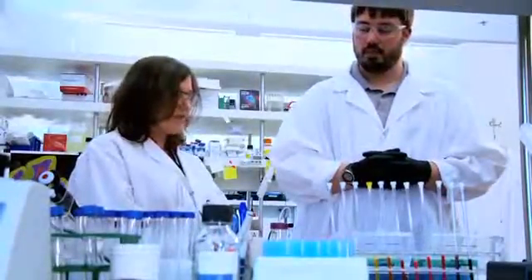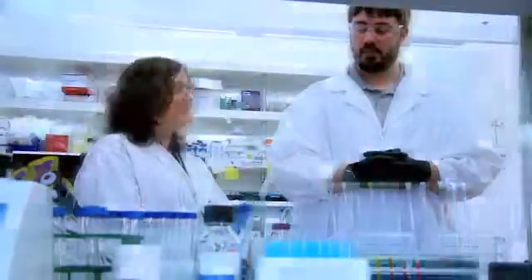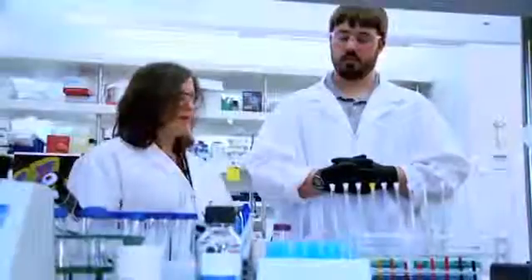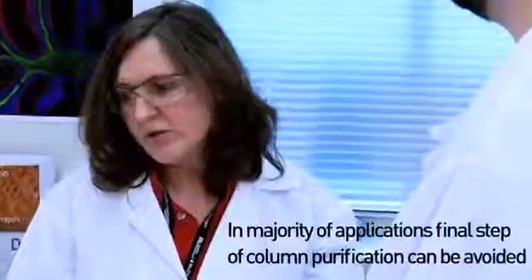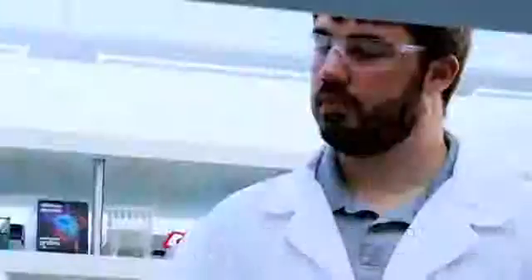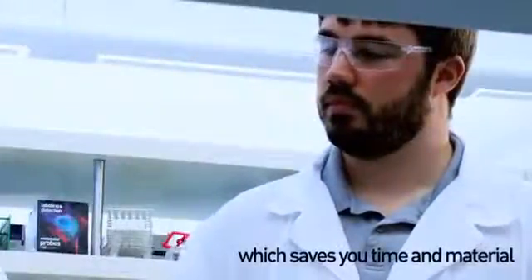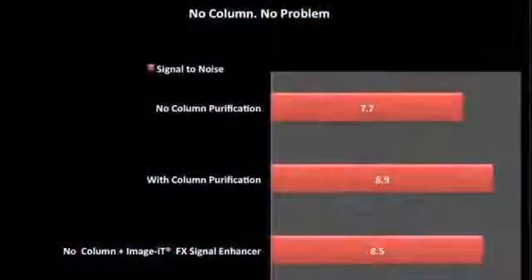Most people in applications where they're doing microscopy or flow are gonna do a series of wash steps. So you could take this conjugate and go and do the cell staining, and while you're doing wash steps for flow or microscopy, you're getting rid of any unbound dye.